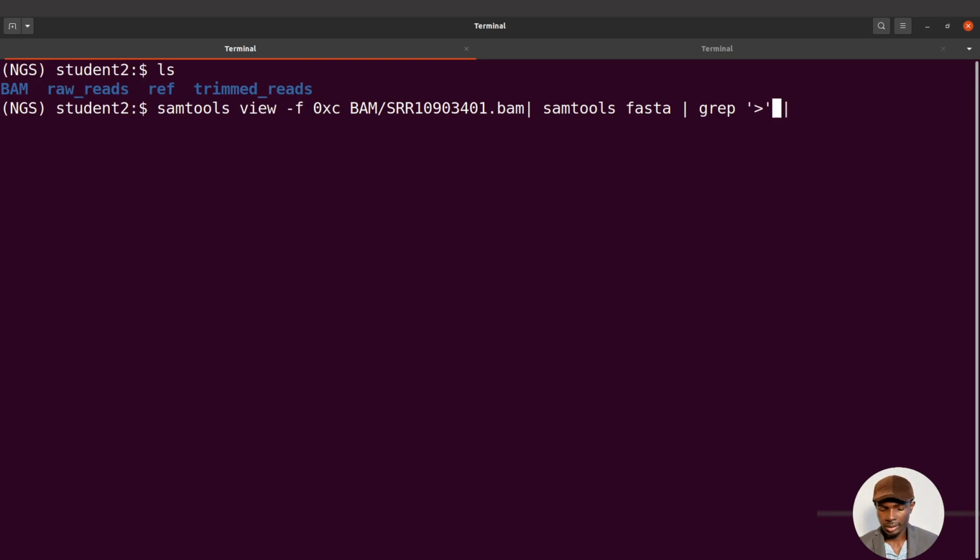Let me just do it here. I think I'll just leave some space here. That's fine. So we'll add an awk command. I'll say awk -F, and then this is what I'll do. I'll bring a single quote.